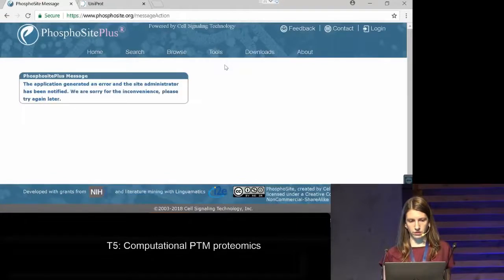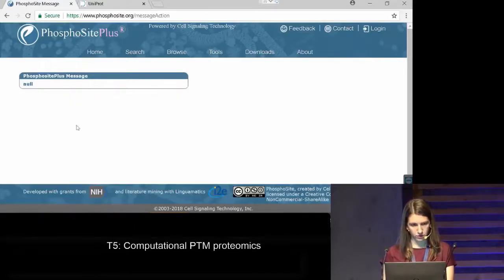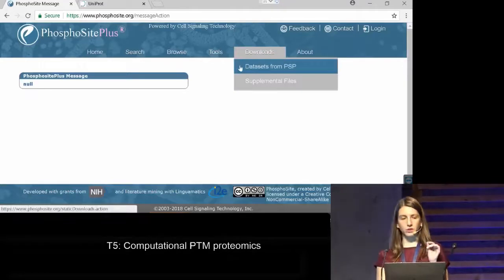For future, don't do it now. You will be asked, this doesn't usually happen. Of course it happens now. It's not our fault. But anyway, you would see a lot of tables that you can download for them.